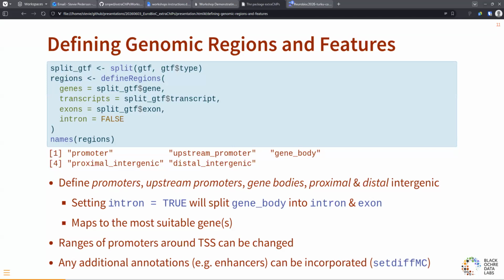And I also do it this way because if there's a transcription start site within a gene body, it gets called a transcription start site. A lot of genes have got multiple transcripts with alternate transcription sites, and this calls them all as transcription start sites. So you will have a gene with multiple transcription start sites. I just thought that made sense.